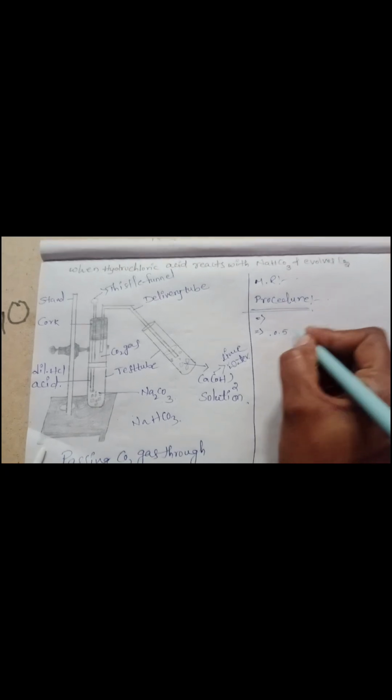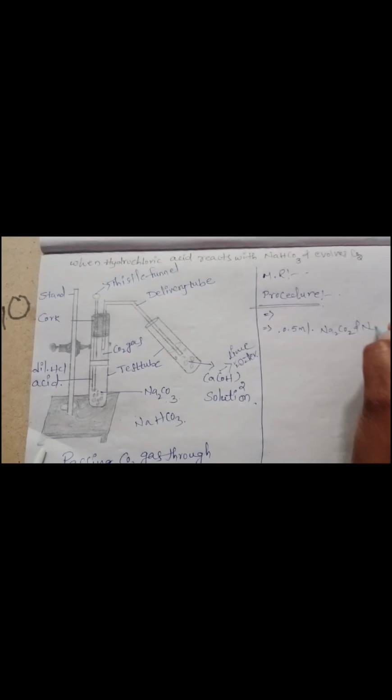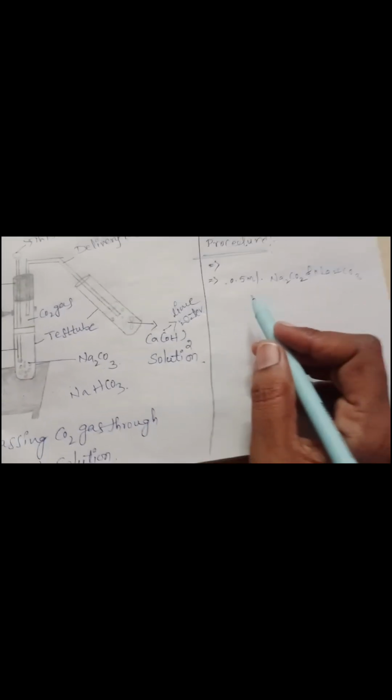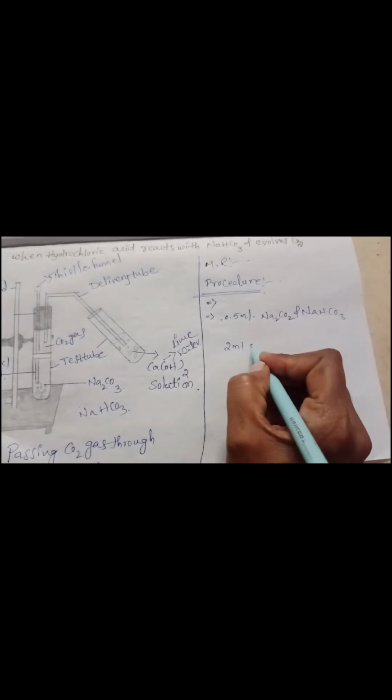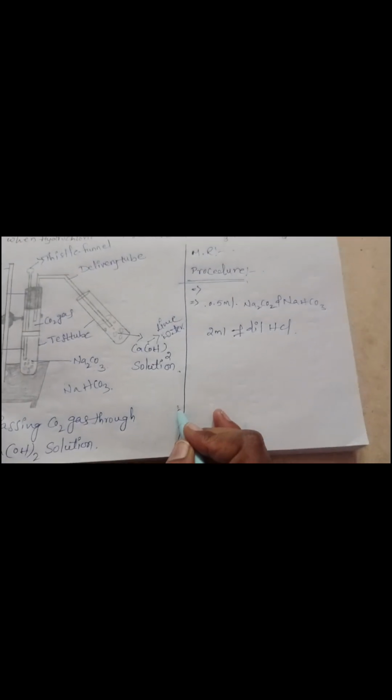In the second point, take 2 test tubes and add 0.5 ml of sodium carbonate and sodium hydrogen carbonate in test tubes A and B. Next, add 2 ml of dilute hydrochloric acid.